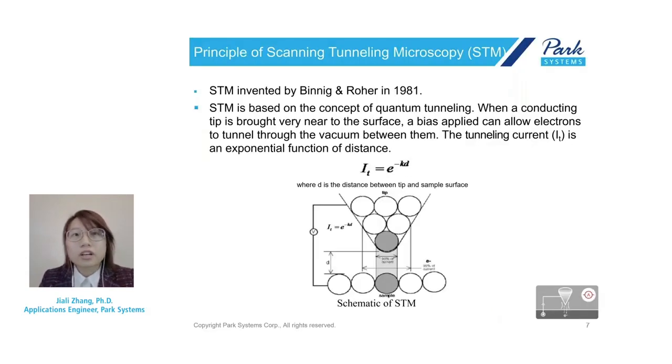So let's first look at the basic principle of STM. STM is one of the application modes of the scanning probe microscopy family. It was invented in 1981 by Binnig and Rohrer at IBM Zurich. Five years later, they were awarded the Nobel Prize in Physics for its invention.